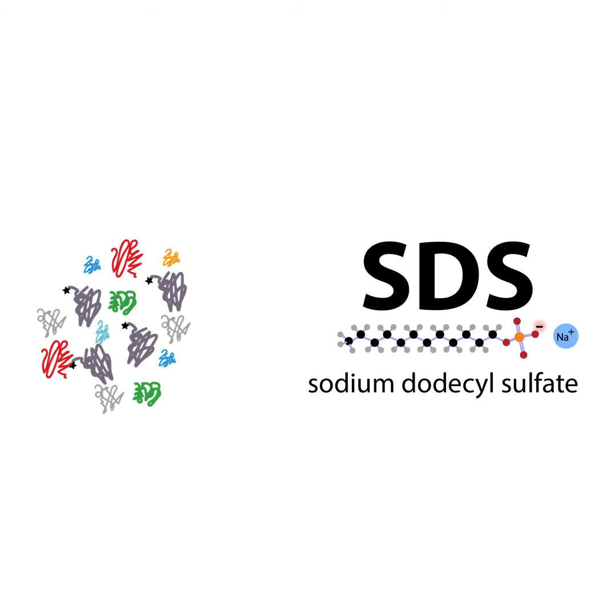Also, the way that we get the proteins to move through the gel, the electrophoresis part, relies on the proteins being negatively charged, because basically you use a charge gradient where you have a negative charge at top that's going to repel the negatively charged proteins, and a positive charge at the bottom that's going to attract the proteins. So we want all the proteins to be negatively charged and unfolded.